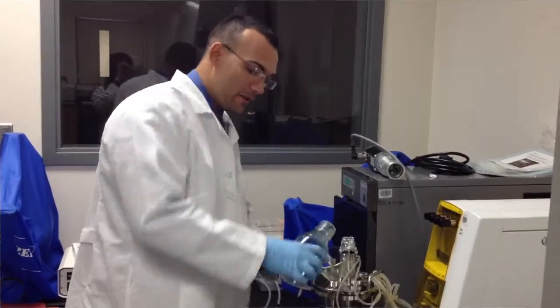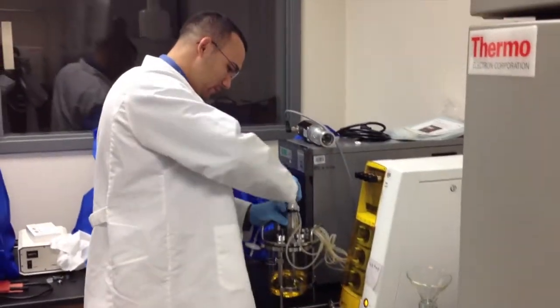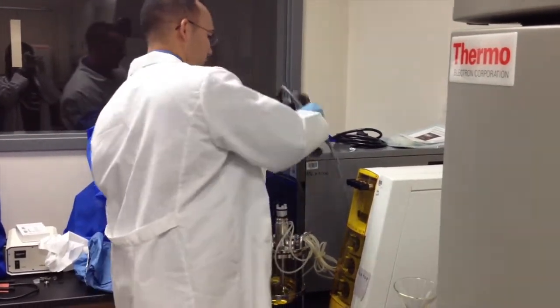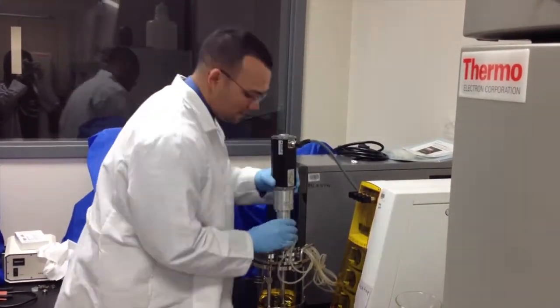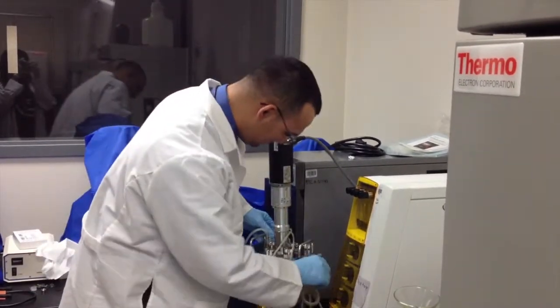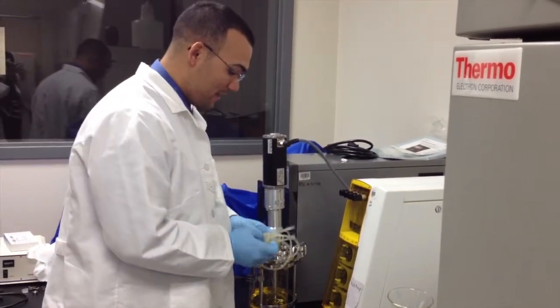Now that we put all our LB broth in, next step, let's remove the aluminum foil from the motor and install the motor itself. Make sure it's screwed in there. Alright, next step is we are going to put our tubes for the acid and base.